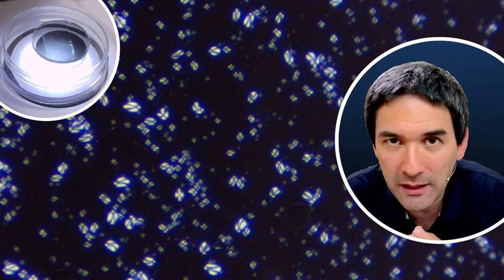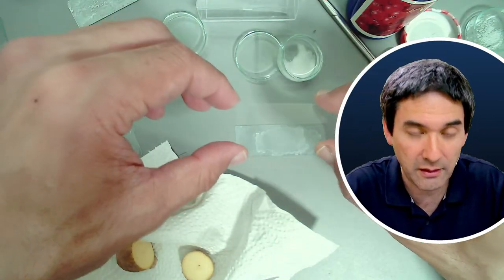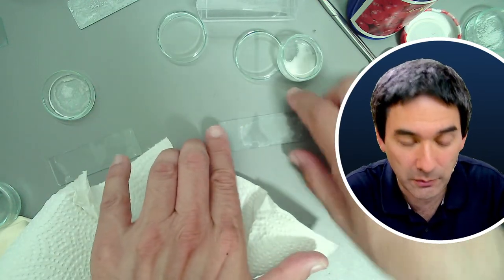The short answer is yes, but you have to use either a so-called dry mount, which basically means no liquid mounting medium, or a mounting medium which does not dissolve the crystals. That might be a little bit difficult. For example, if you have crystals that dissolve well in water, you might use a very hydrophobic resin-based mounting medium. Otherwise it's going to dissolve the crystals, so that's a little risky. What I would probably suggest, and this does work, is you have your crystal slides here. Let me go to the desk view again. I know this is going to sound crazy, but this is what you call a dry mount. You take a cover glass, I've got those gigantic cover glasses, you put it over and you simply tape them down on the edges.